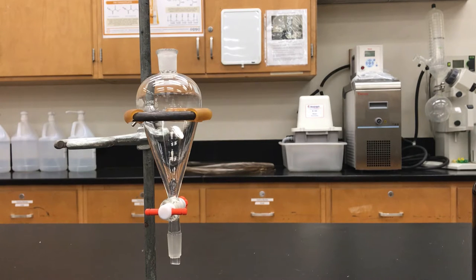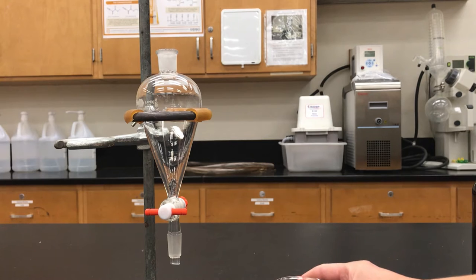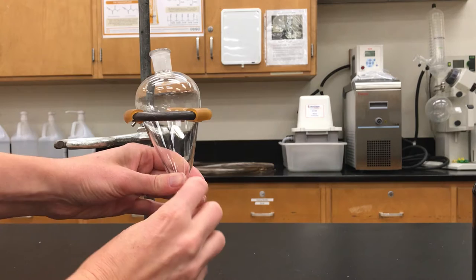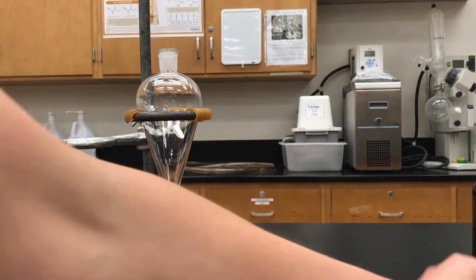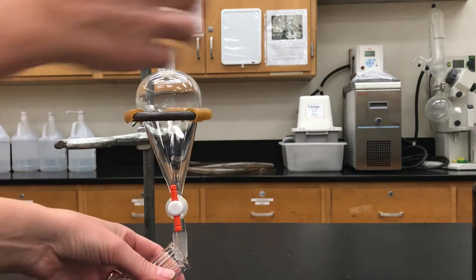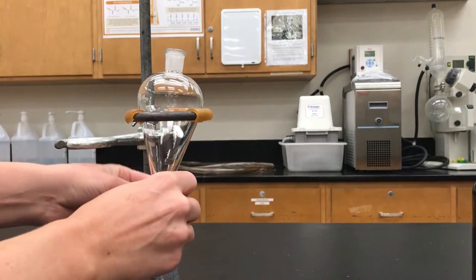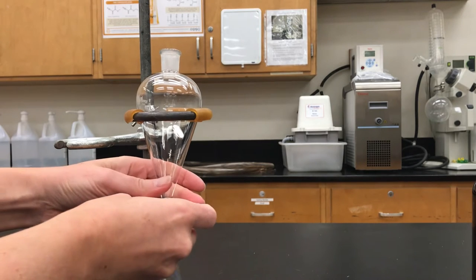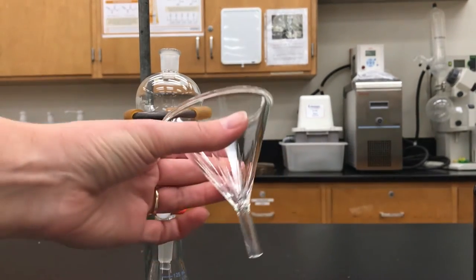Now I'm ready to add my liquid. At this point it's good to check your separatory funnel again and make sure the stopcock is in the horizontal position, because if it's accidentally vertical the liquid is just going to drain out. One way to prevent that is to always put an Erlenmeyer flask or beaker underneath it — that way if you forget to check, you can catch the liquid and your whole experiment isn't ruined.